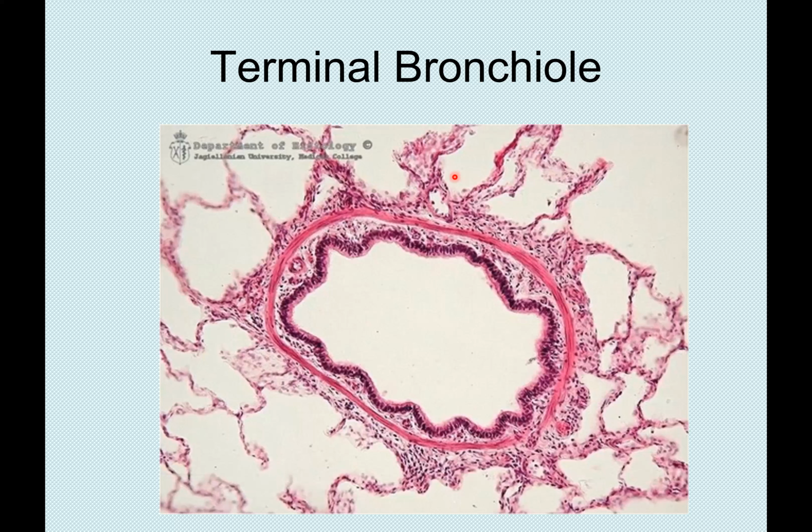So this, who can tell me the type of epithelia that is here? This is a terminal bronchiole. One beautiful thing you also have to notice is that at the trachea region, you will not see these things. When you are not seeing these things, it tells you that you are nearer to the lungs, the alveoli. These are the alveoli. So when you see something round with muscle and then things here, it tells you you are looking at the terminal bronchiole. From the terminal bronchiole, you go to the respiratory bronchiole. So go and look for this. These are some examinable questions.